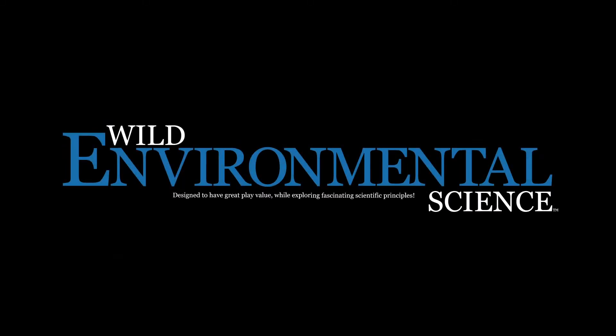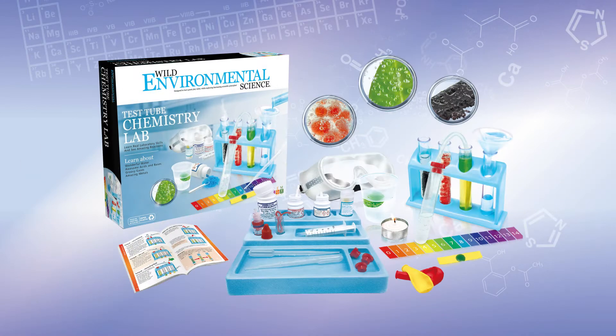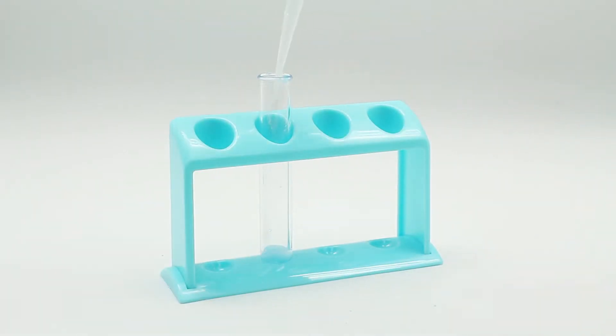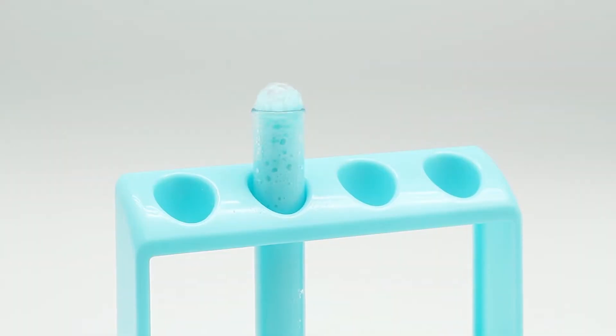From Wild Environmental Science comes the Test Tube Chemistry Lab. Use real lab equipment and chemicals to see amazing chemical reactions in action.